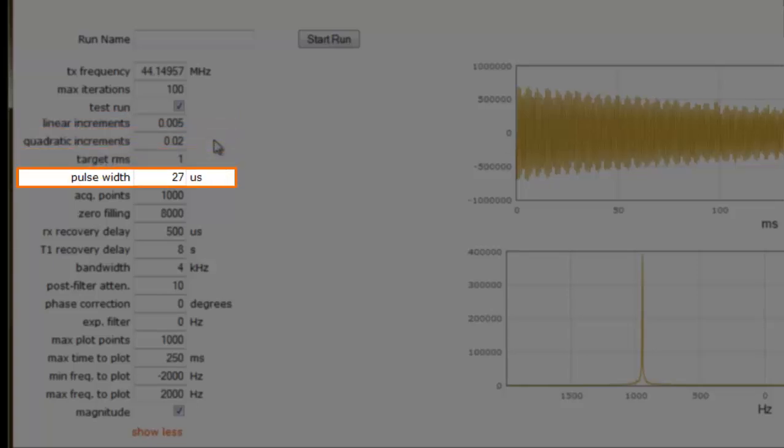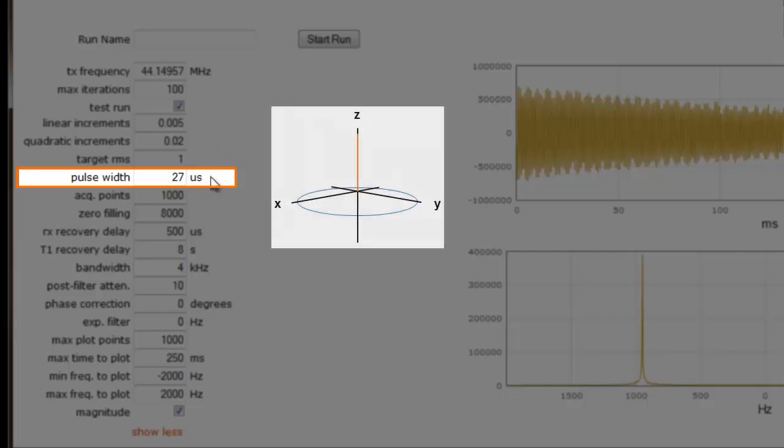The next important parameter for shimming is the pulse width. The pulse width is the length of time the transmitter is turned on in order to produce a 90 degree tip angle. The 90 degree pulse width value is measured in microseconds, and varies from instrument to instrument.